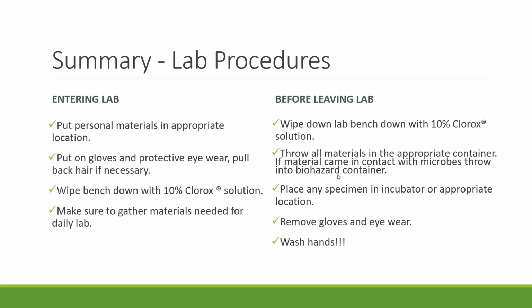You're going to dispose of everything appropriately in the biohazard and autoclave containers. Put your specimens into the incubator, and if it's a petri dish, you're going to wrap it with parafilm. And something I failed to mention, you actually turn it upside down and put it in the incubator. Then after everything is cleared off of your lab station, a lot of times we will wipe it down again, just to be twice as safe.